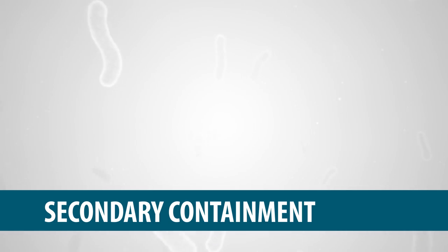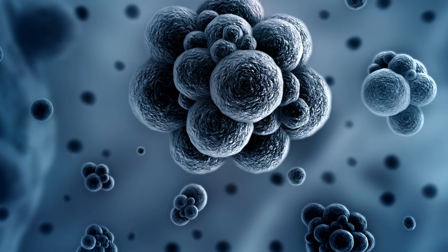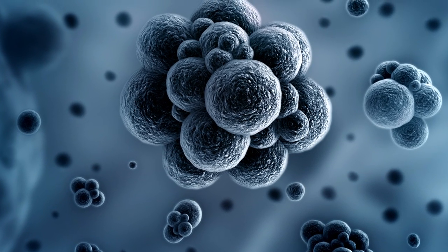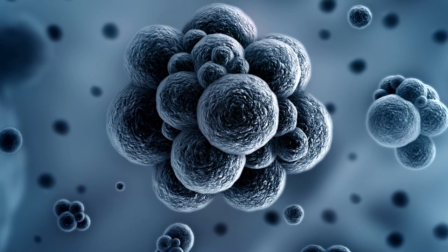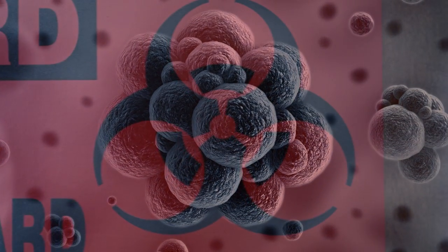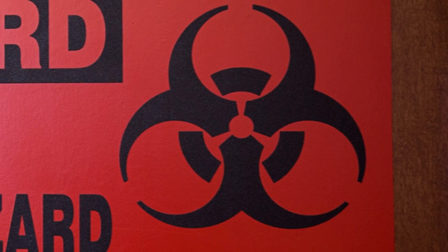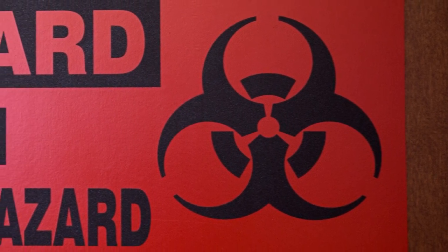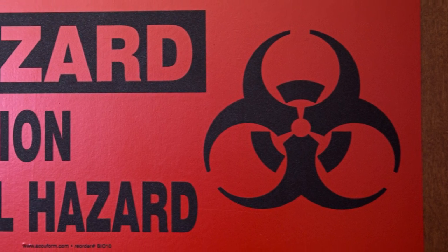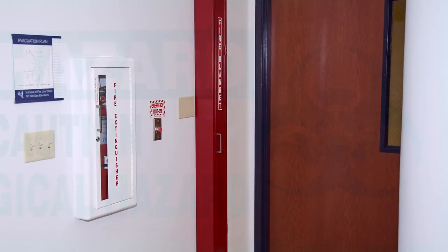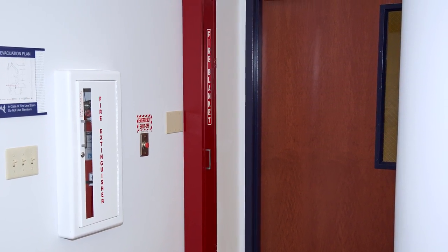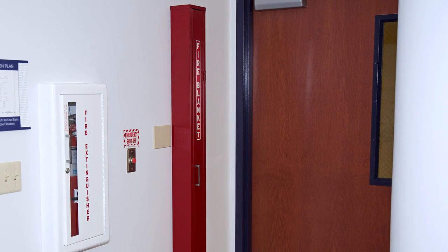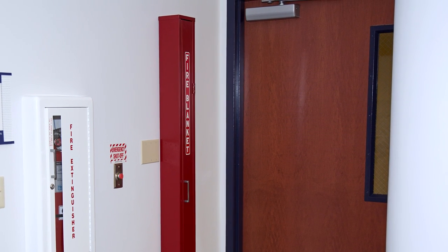Secondary Containment deals with protecting the outside environment from exposure to infectious organisms. It depends principally on the design of the laboratory and the availability of equipment. As well, laboratory workers should maintain the lab's safety features, such as keeping a closed door closed or leaving an exhaust fan on.